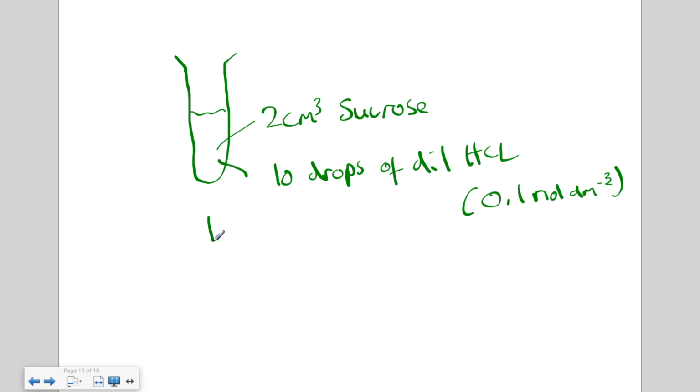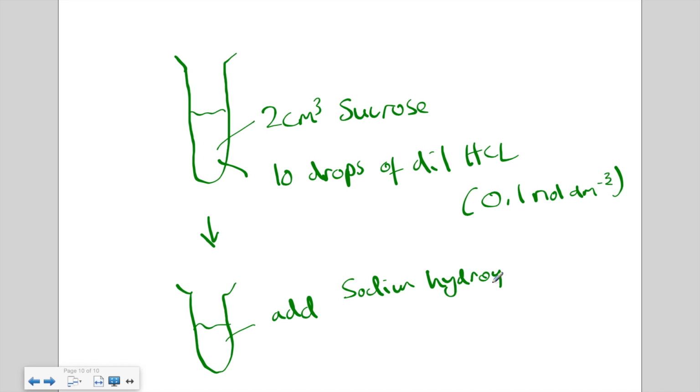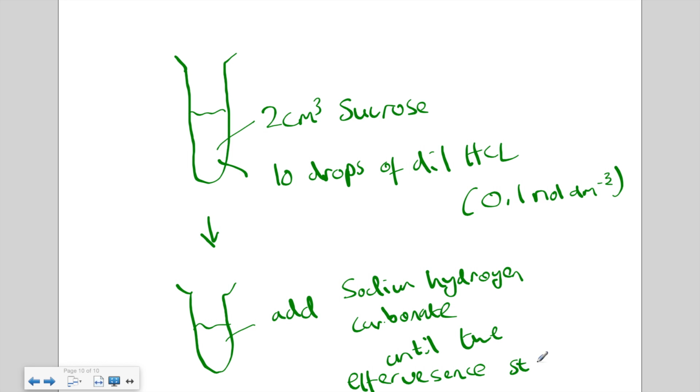And then we further added sodium hydrogen carbonate until the effervescence stops. And that is just until the big fizzing stops, not any kind of small bubbles, otherwise you'll put way too much in and you won't see a result.